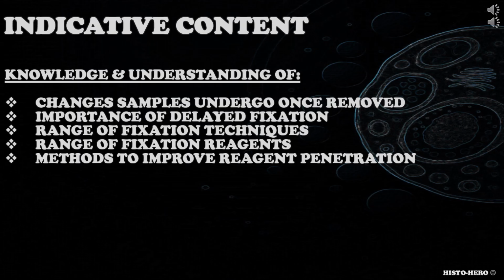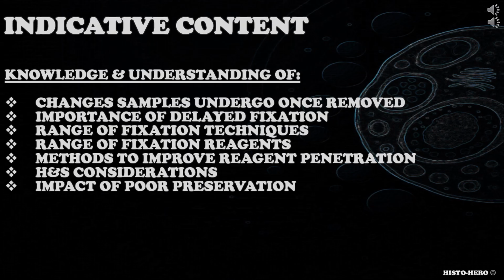Slicing. The health and safety considerations that apply to both the practice of sample fixation and the chemicals employed in tissue fixation. COSHH. Risk assessment. Environmental monitoring. The impact of poor sample preservation on patient management and outcomes, e.g. interpretive/diagnostic issues. Impact on reflex testing e.g.